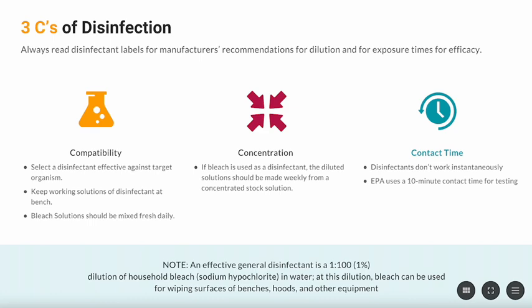By following these 3 C's, laboratory personnel can help ensure that they are using the correct disinfectant for their application and that it is used in a safe and effective manner.